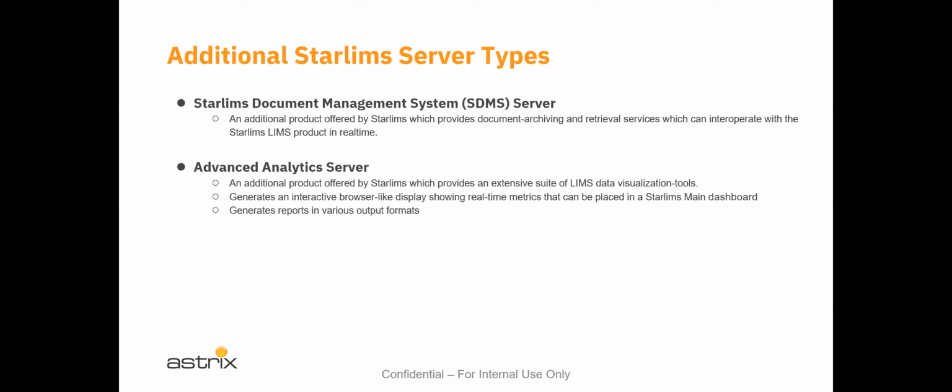But with STARLIMS, they have a specific flavored version of it that allows that particular product to be displayed in the center pane in the dashboard of a STARLIMS system. So it enables live, for all intents and purposes, data to be evaluated and to be manipulated and pivoted, as you will, any different type of manipulation you might want to look at that provides real-time business layer updates to the end user.